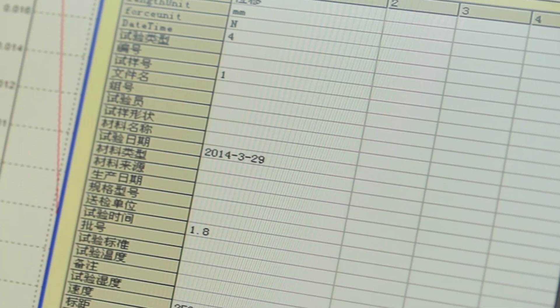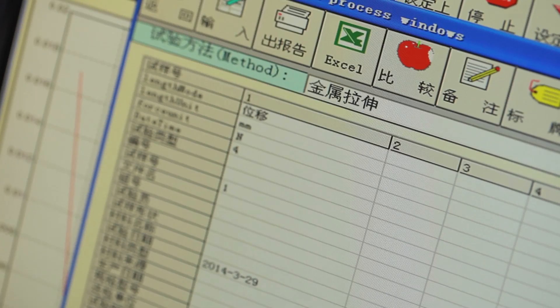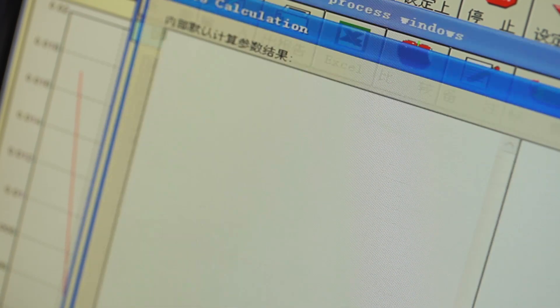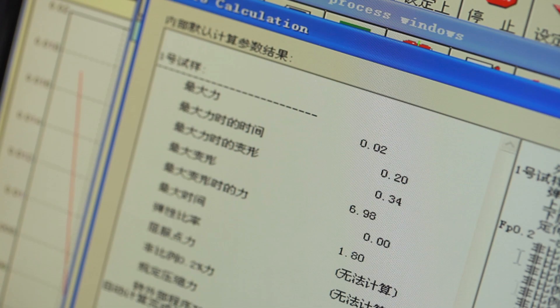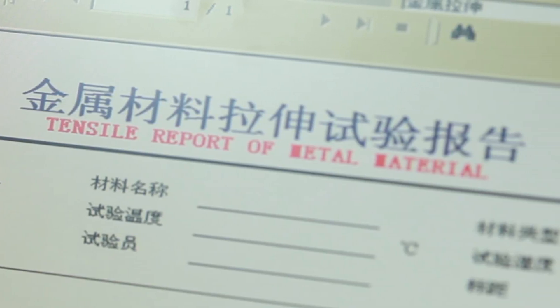It offers automatic data processing and storage, multiple curves display and analysis, and can print reports.